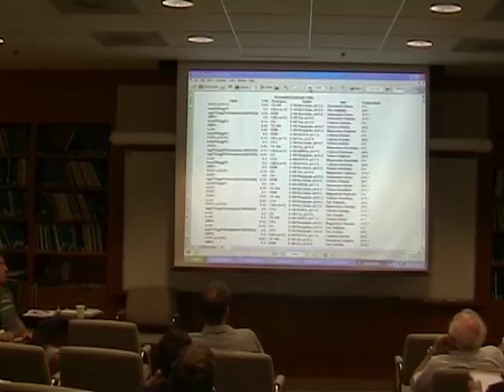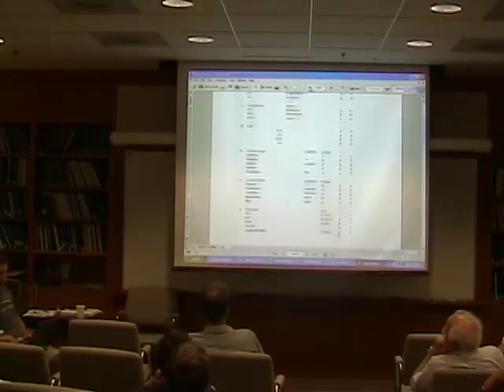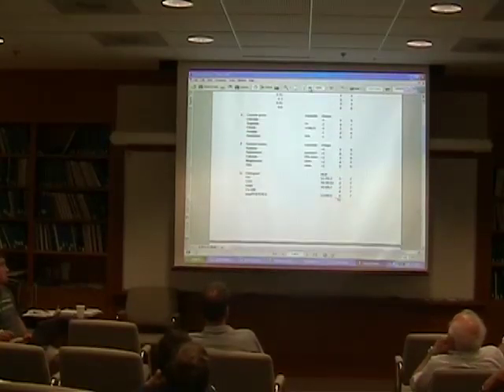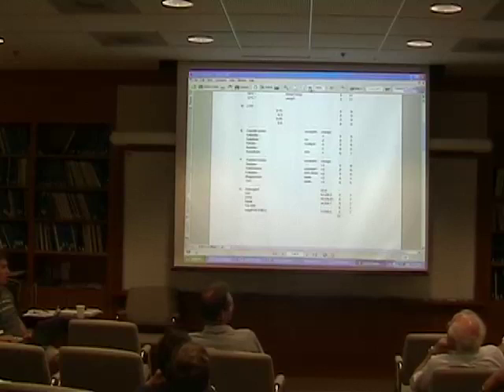Okay, and so then if we translate that into words, you would come up with an incomplete factorial screen something like this. Now, it's not completely random, and one of the reasons, this is only a minor reason, is that not all of these anions and cations are compatible with one another. Could you stay up for a while because I haven't read it? What do you want to look at? Yeah. Where? Have you all read that? That's all right, I'll leave the last page up in a minute.